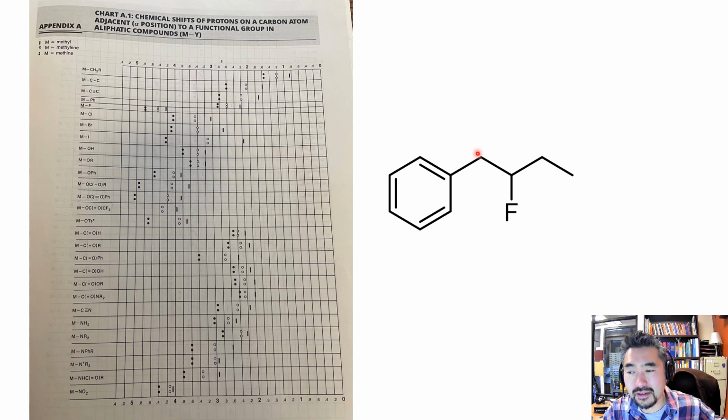What about this carbon? The most influential thing that it's directly attached to is the phenyl group. Benzene, remember, is called a phenyl group. This is a methylene, so again, it's that white circle symbol, and that is next to phenyl. So where is that phenyl? Yeah, right here. Methylene attached to phenyl, so something like that. So you expect to see something like 2.6 ppm for those protons.